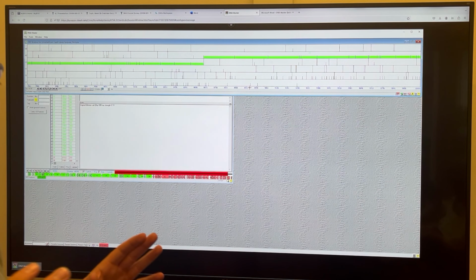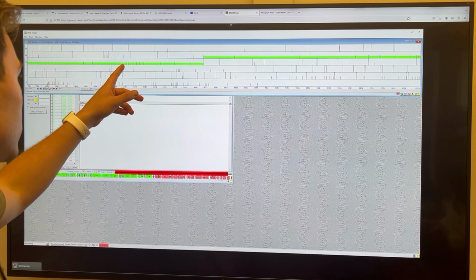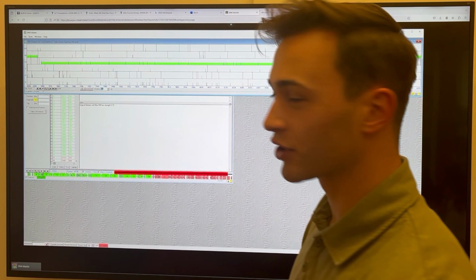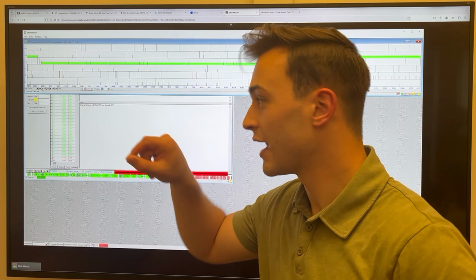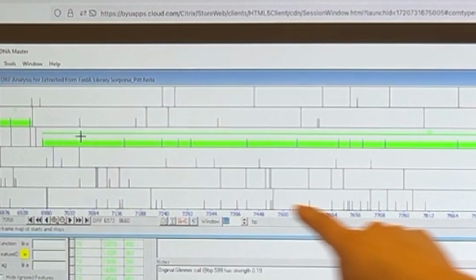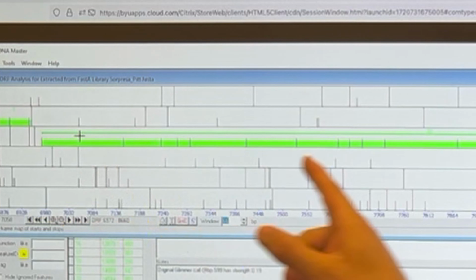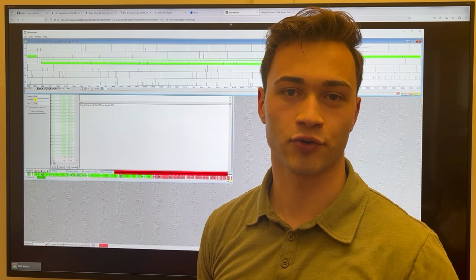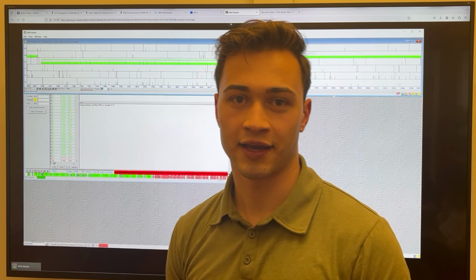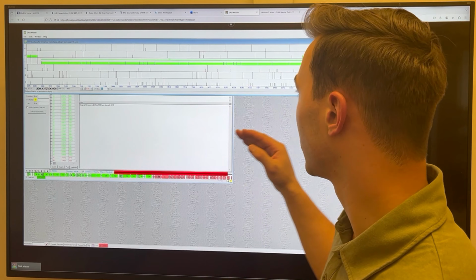So you'll navigate to the gene that you want to annotate. In this case, we can do number 10. What you're going to do is take your mouse and click at the beginning. You make a click, and then it should just highlight your whole ORF there in green. If you're doing a reverse gene, it'll be in red, and you'll actually do it from the right side. But in this case, it's a forward-facing gene, so it's pretty straightforward.